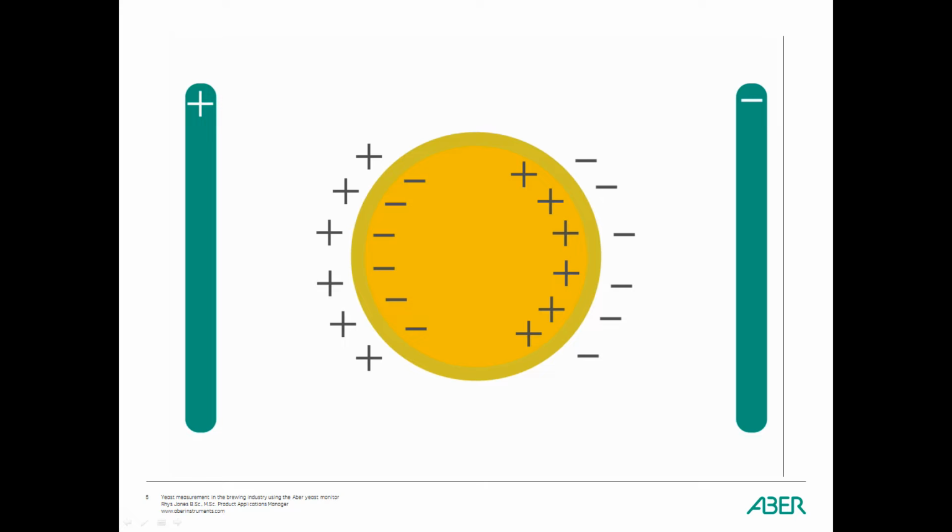Therefore, with every live cell acting like a tiny capacitor, we can detect the capacitance signal, which is proportional to the live cell concentration.